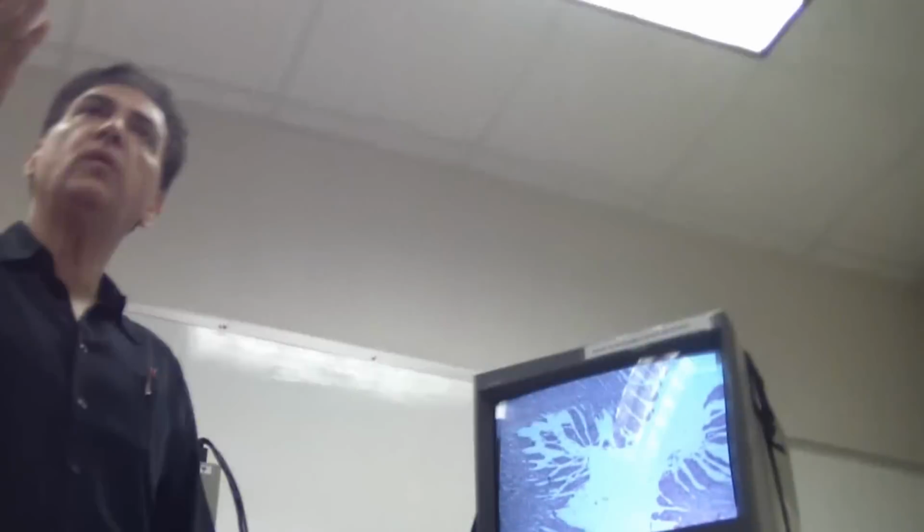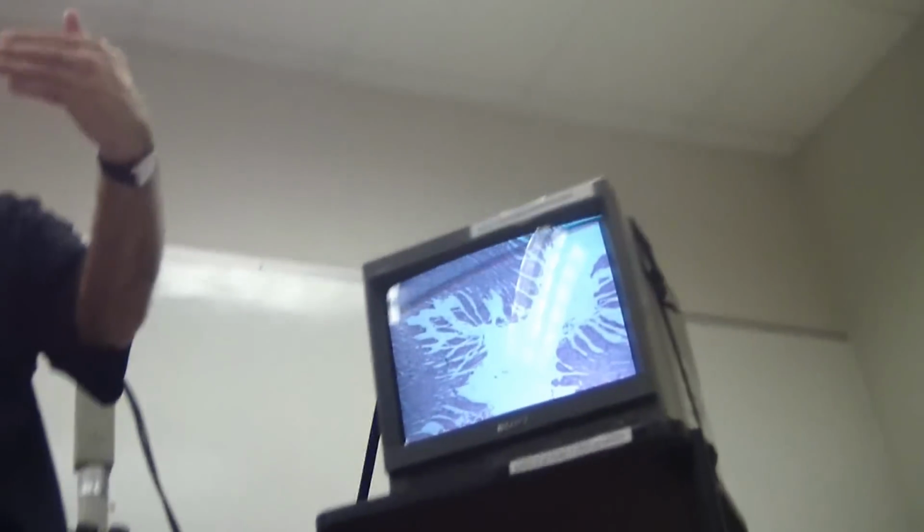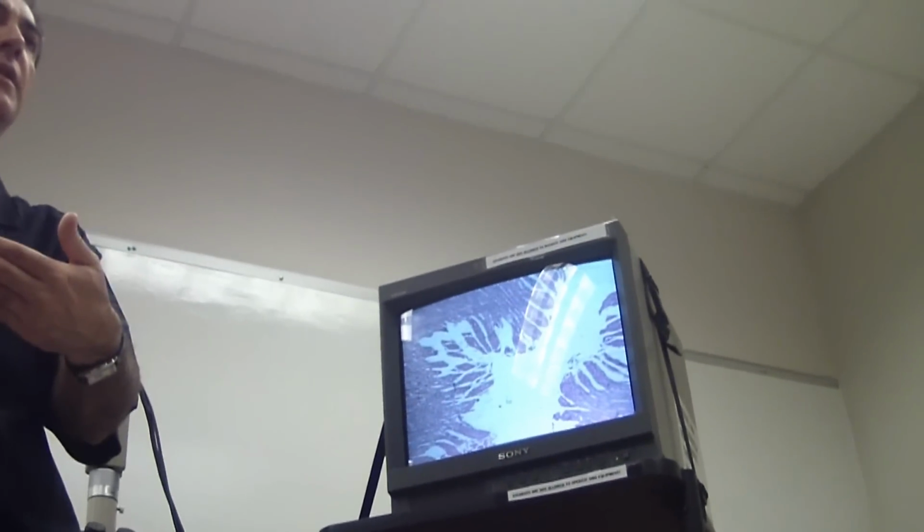Now, remember, first, if you look at your handout, once again, we need to identify what? The layers. That's our first task. The mucosa, the submucosa, the muscularis externa, and serosa or adventitia.